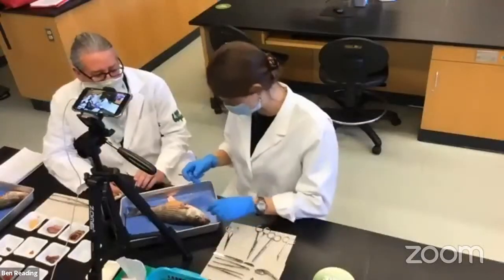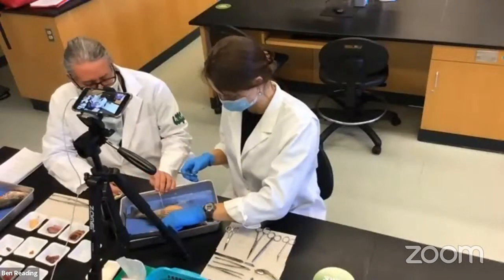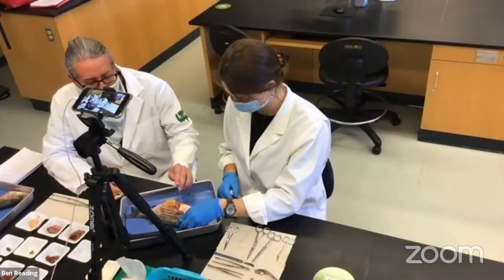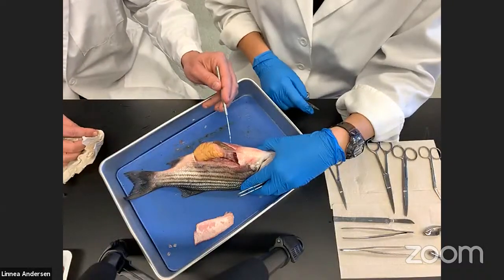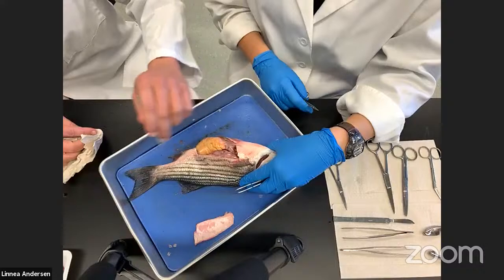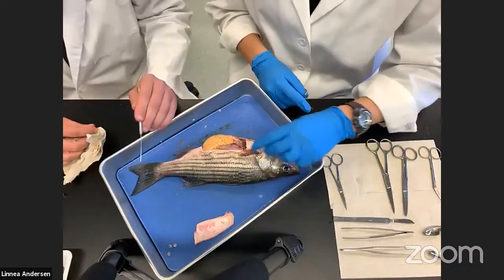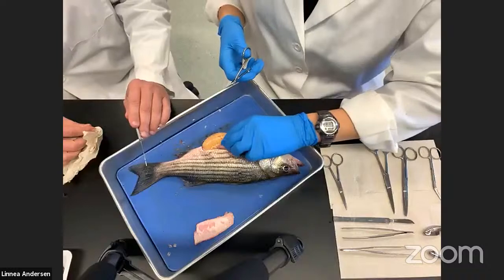Linnea has already prepared this fish. We cut away a window on the side of the animal — inserting scissors into the anus, cutting ventrally up to the pelvic girdle, then up to the dorsal aspect, and then cutting this piece out. This is the proper way to dissect a fish. What we see then are the internal organs. This fish is in fact a female. This organ right here is the gonad — that is an ovary — and it's fully loaded with eggs.